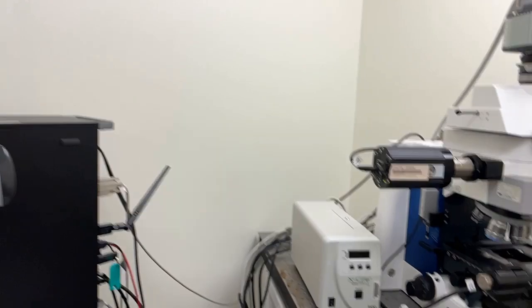Tomorrow I can switch that brain into sucrose and then leave it, and maybe I can slice it and look at it in the evening. I guess I could also start trying to get photos of things, just looking at images, which is easy and straightforward.